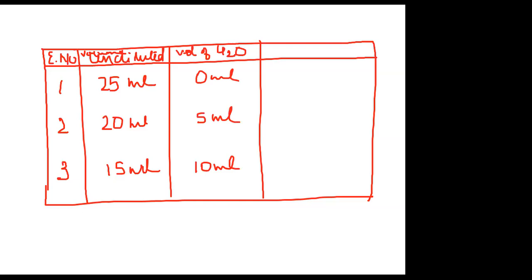Here you will write time in seconds. All right. So when I'm writing time in seconds for the magnesium strip to disappear, here you can write down in minutes and then convert that into seconds. Because suppose in the first case I got 2 minutes and 6 seconds. All right. So this I can write as equal to 126 seconds. So both the things you can write, or you can just write the seconds straight away, no problem.